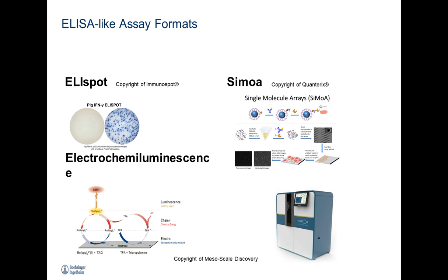The versatility of these assay formats has given rise to, we'll say, much more complex and much more technology-based assay formats that I refer to as ELISA-like formats, and you might be familiar with some of them.